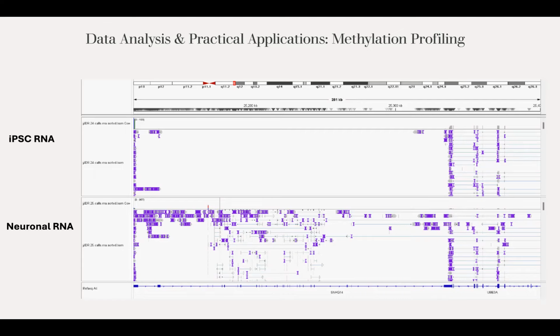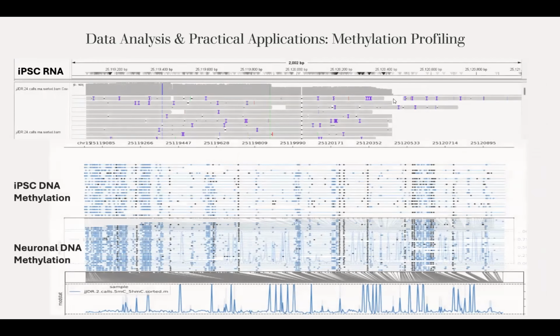And so we wanted to see, is this transcriptional boundary due to some sort of differential methylation between iPSCs and neurons? If you see this boundary here on the left, this boundary here is just a slightly different view. So this is iPSC RNA, and these are methylartist plots that we generated for this same locus, so it tracks 1-to-1.